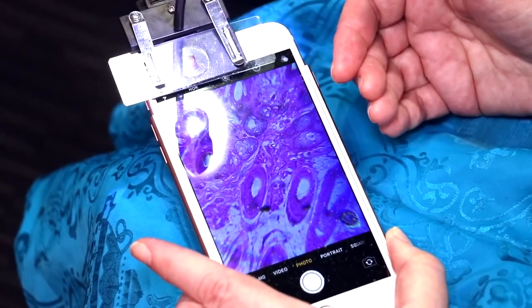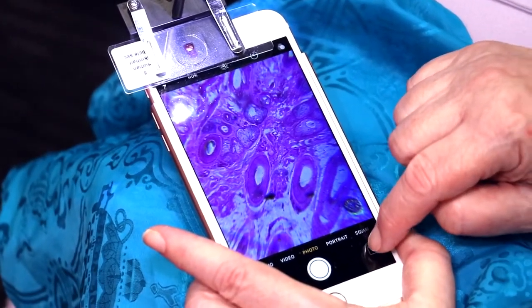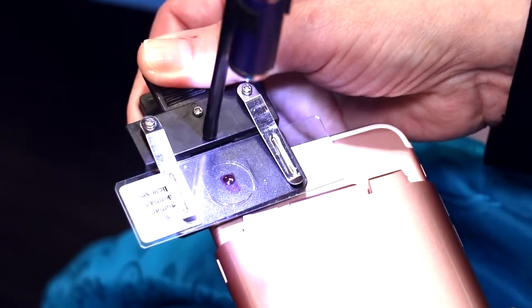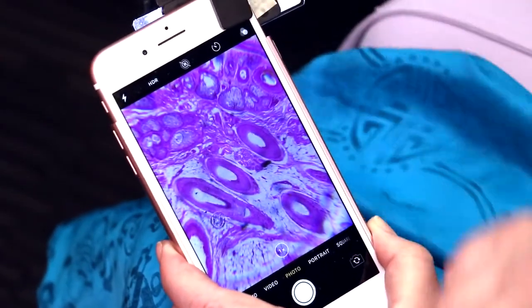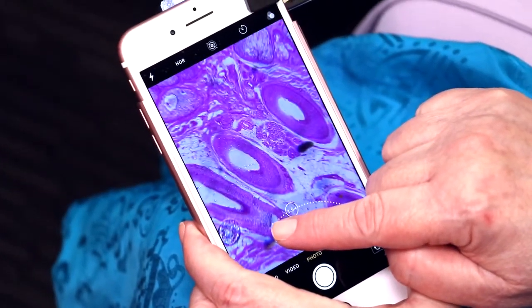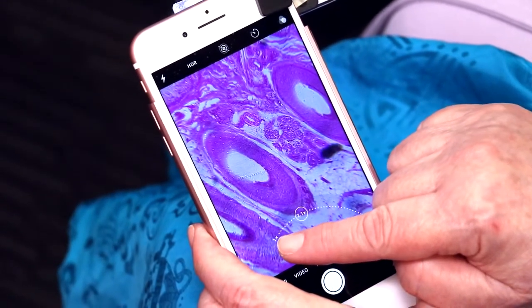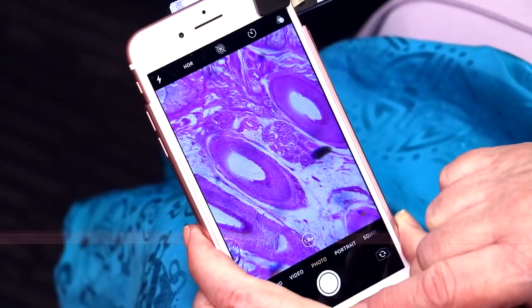This is around 200x optical. It also works with the camera on the other side, so I'm going to flip to the other side and put the microscope over the lens of the phone camera. These tend to be sometimes higher resolution. Sometimes they have a 2x optical feature, as does this one. So going in with the 2x optical, you're going to get better resolution, and you're creating, in essence, a compound microscope. This is around 400x.